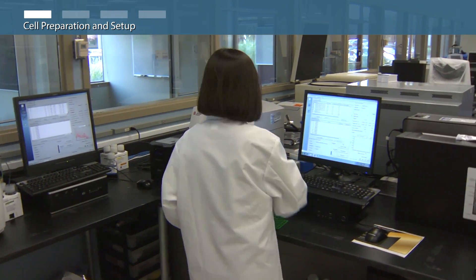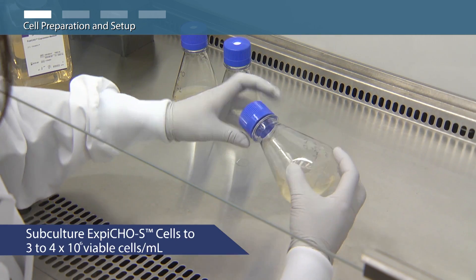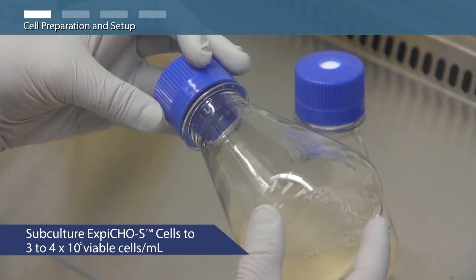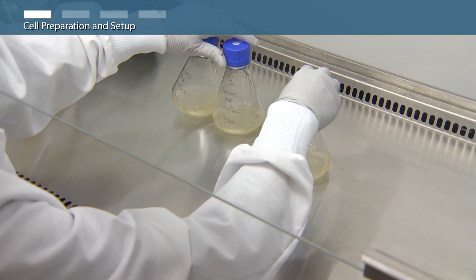On the day prior to transfection, determine XBCHO-S cell density and viability. Subculture the XBCHO-S cells to a final density of 3 to 4 million viable cells per milliliter and allow the cells to grow overnight.